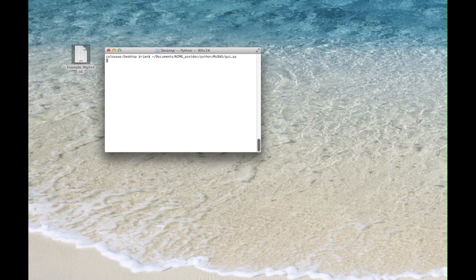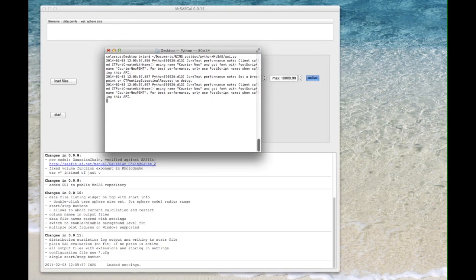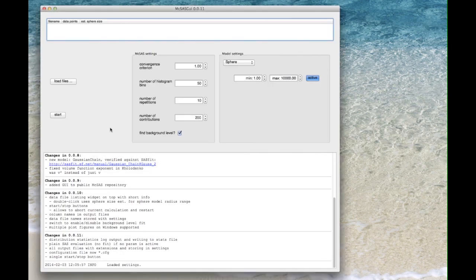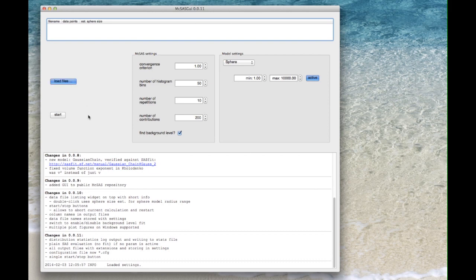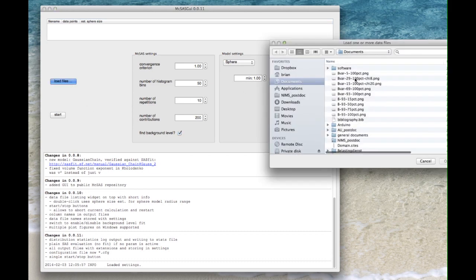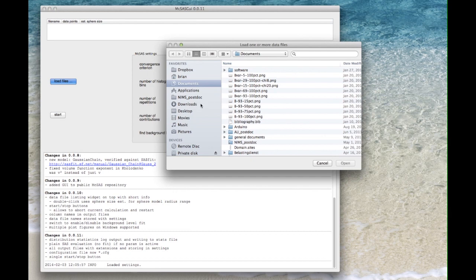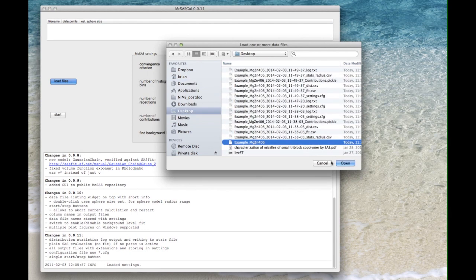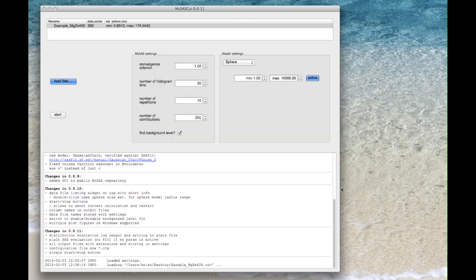So when I start my user interface it looks like this. I can now load the data file. Here we go. So here we have our data file loaded.